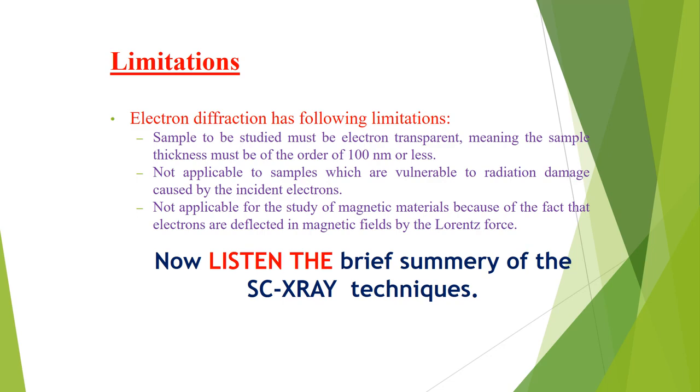The detector is also provided with software that solves all the related information from the scattered beams and their angles, and this software is used to solve the structure of the crystal lattice and the single crystal.